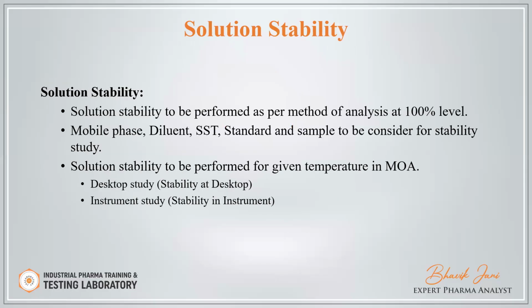Solution stability. Solution stability is to be determined as per the method of analysis at the 100% level. And for the solution stability, you have to consider the mobile phase stability, diluent stability, system stability, and standard and sample should be considered for the solution stability.